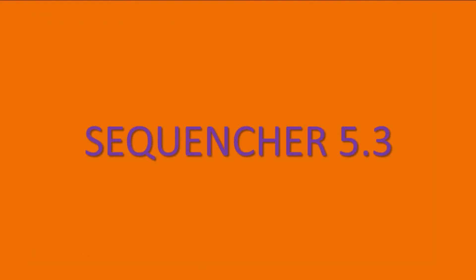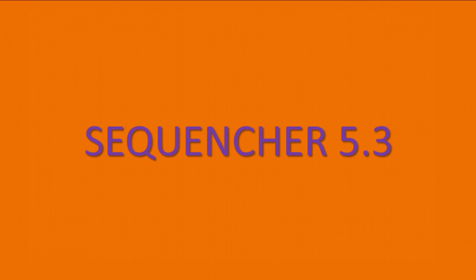Hi, this is Jason from GeneCodes Corporation. We've just released our latest version, Sequencher 5.3, DNA sequence analysis software for Sanger and next-generation sequencing data.